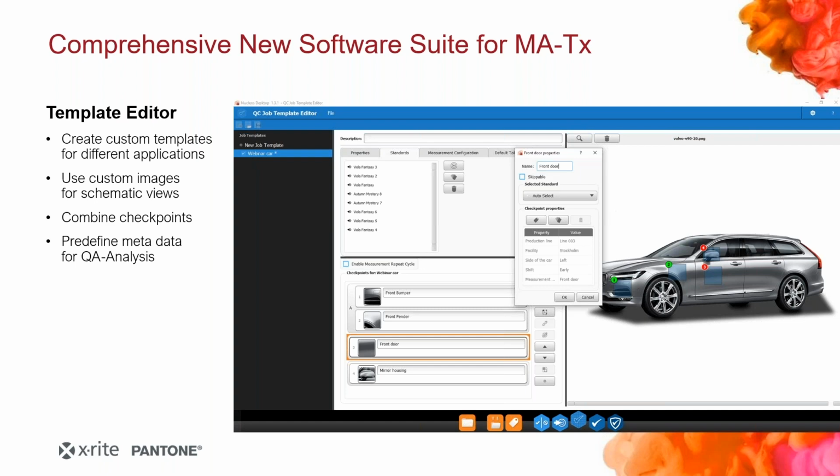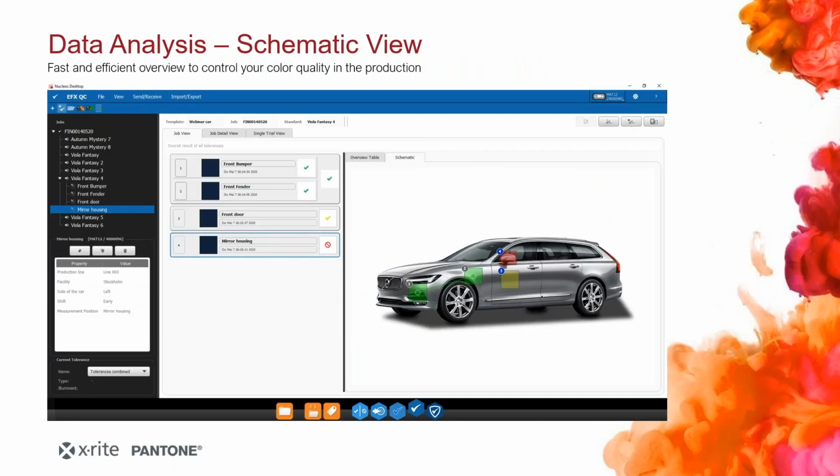Once you have measured your trials or your car in this case, you come back to the software, connect the instrument, and import the job. And after importing the job, you see I made it here with a vehicle identification number, so the DNA of the car. I named this as a job name in order to identify my data.